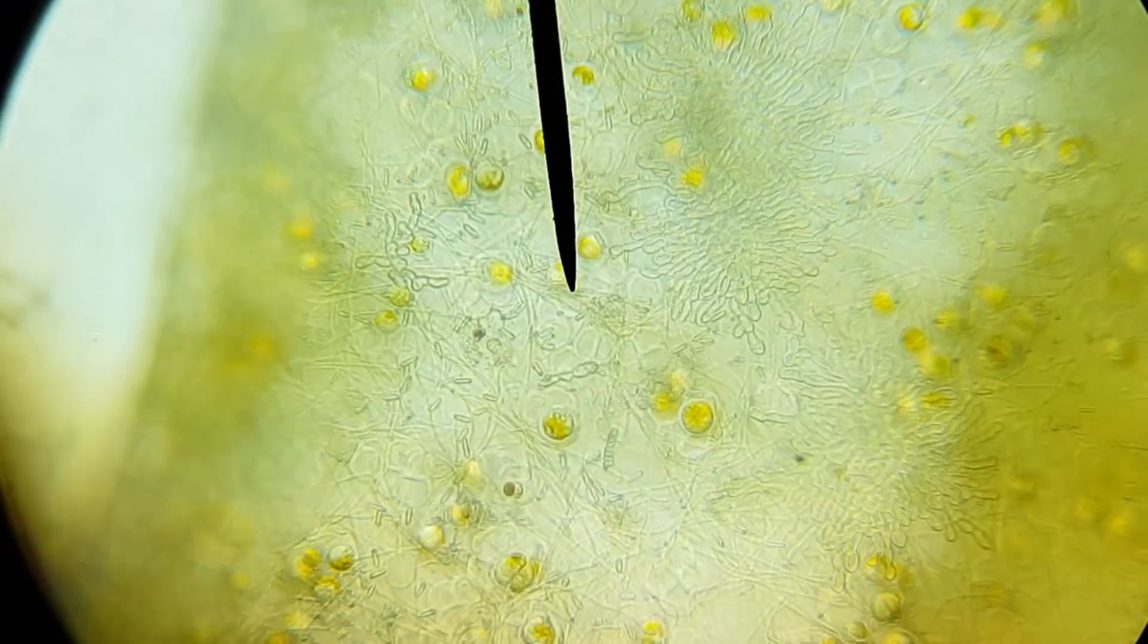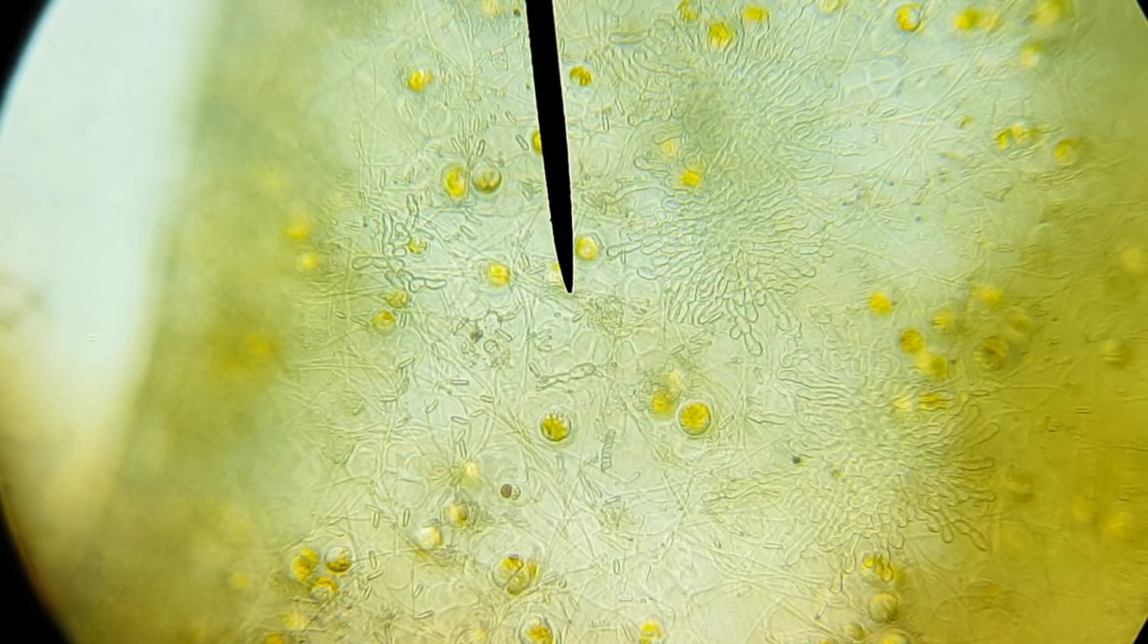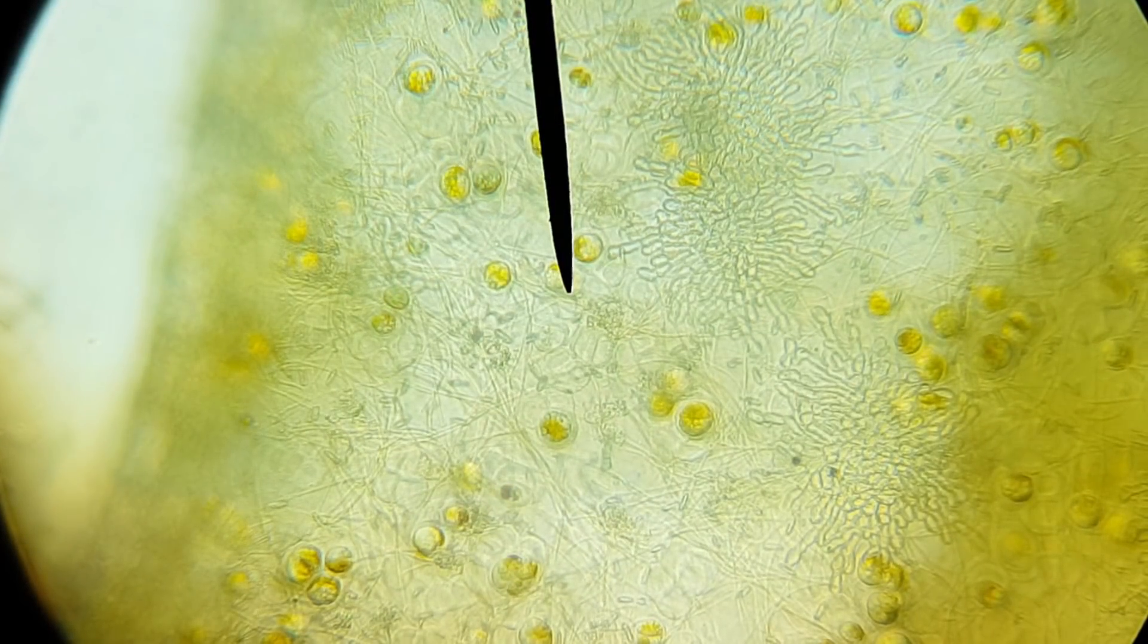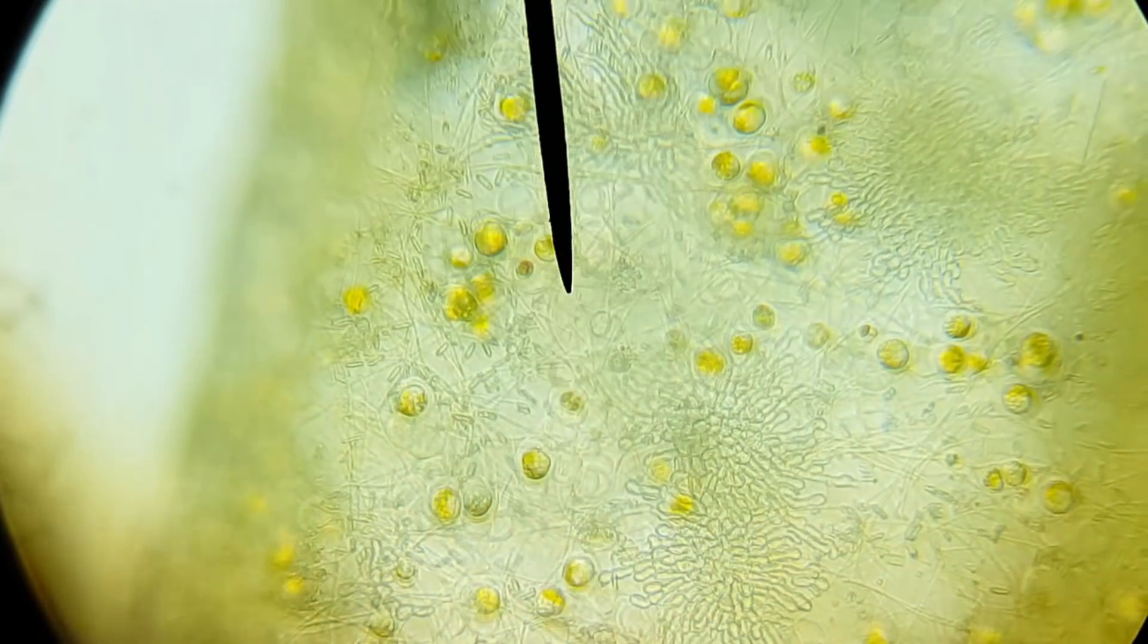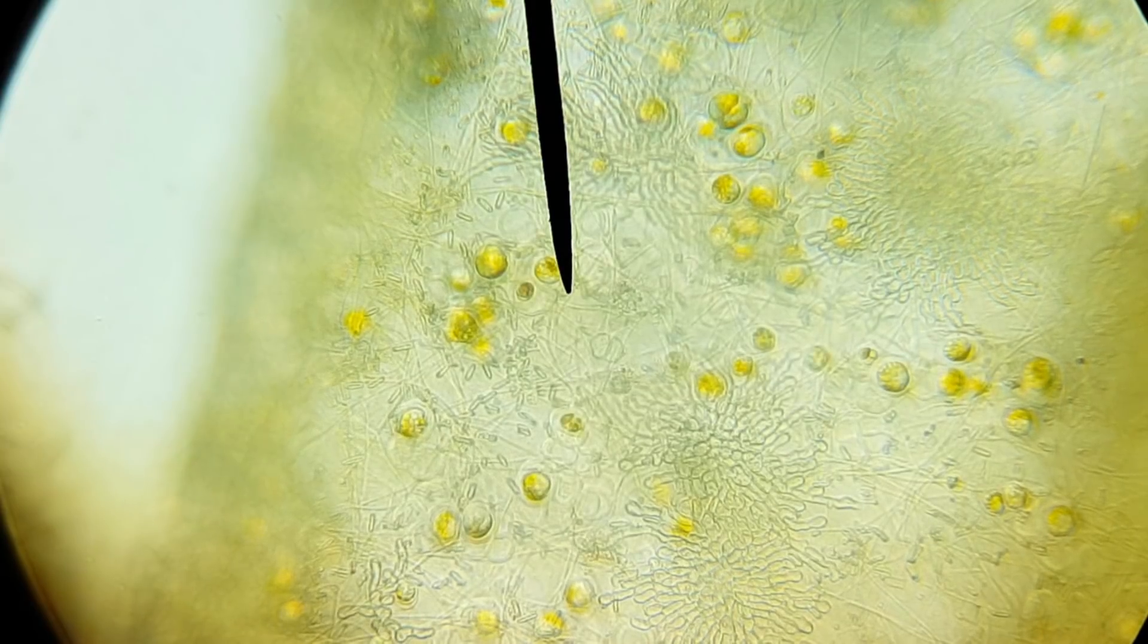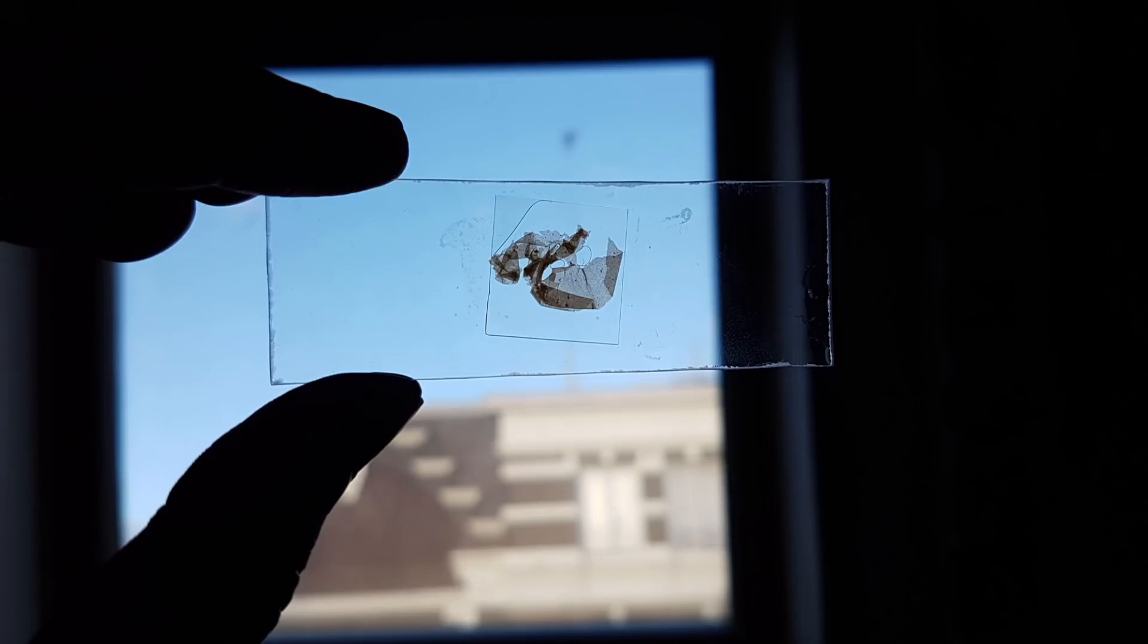I'm starting to feel bad for showing you awesome stuff and then not telling you what you're looking at. But I simply don't know. So if someone out there does know what's going on here, please let me know. And all that cool stuff came from this small piece of algae.